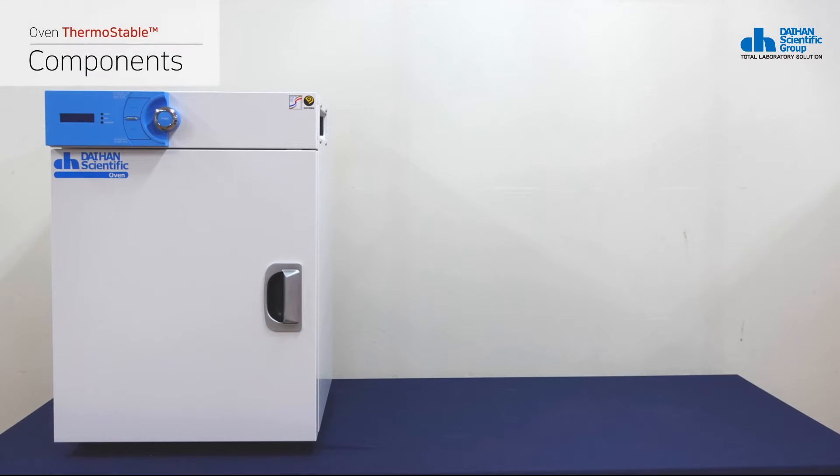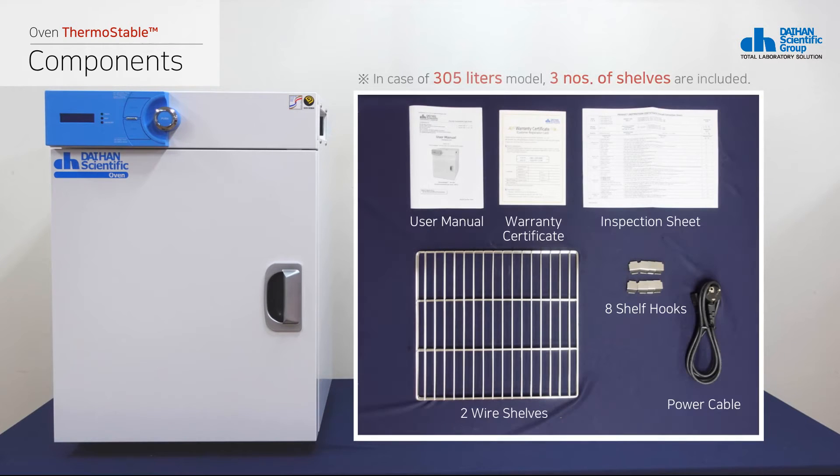The basic 50-liter model of drying oven includes two wire shelves, eight shelf hooks, a user manual, a warranty certificate, an inspection sheet, a power cable, and the main body.